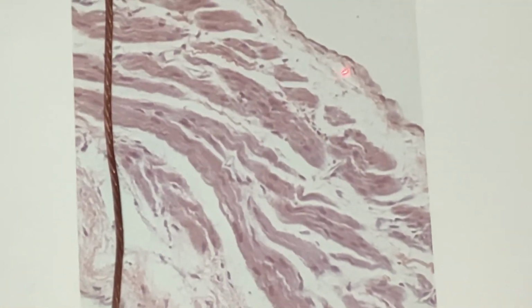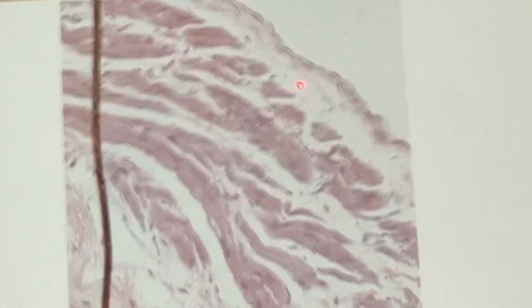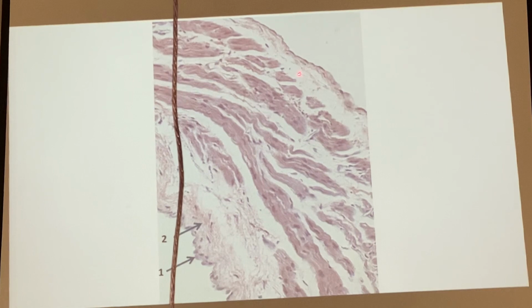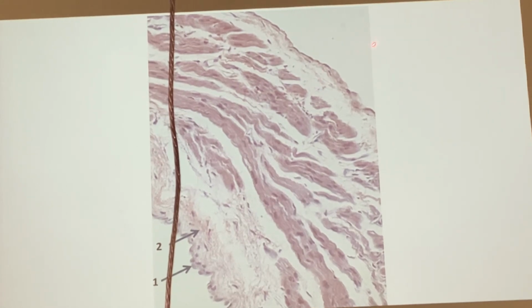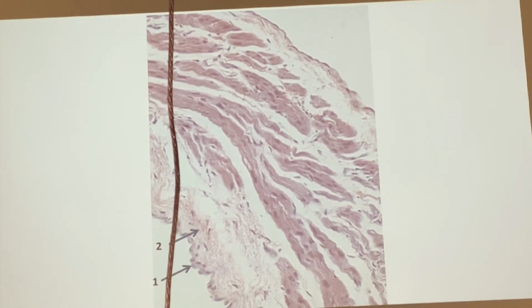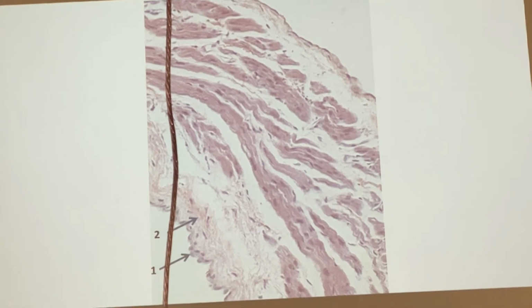And then we have the myocytes, and that one is epicardium. And we see the flattened nucleus is a mesothelial cell. Flattened nuclei, they are mesothelial cells on the outer aspect of the epicardium.